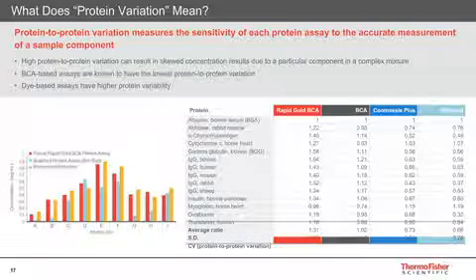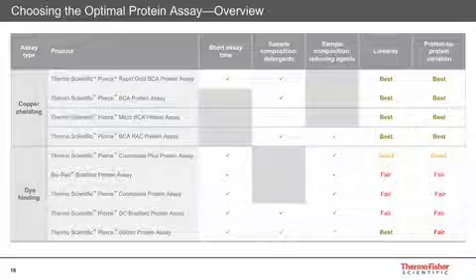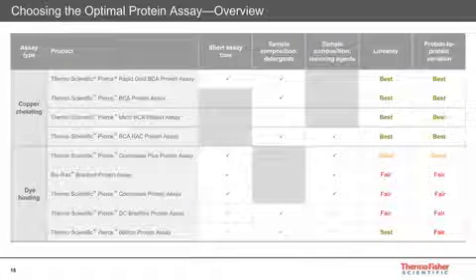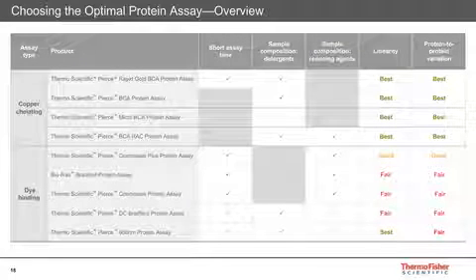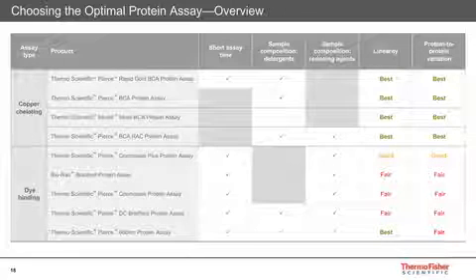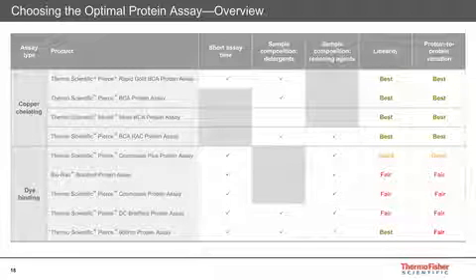The percent CV of the ratios gives protein-to-protein variability with each of these reagents, and here you see that the BCA type assays, or the copper-based assays, show low protein-to-protein variability and low CV around 15%. The dye-based assays show higher protein-to-protein variability.